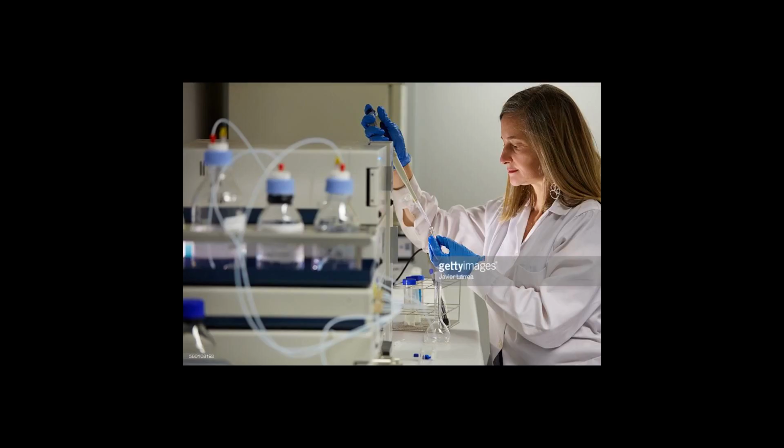This layer changes with any changes in the composition of the mobile phase, e.g., moisture level, causing drifting retention times. Recently, partition chromatography has become popular again with the development of HILIC bonded phases, which demonstrate improved reproducibility, and due to a better understanding of the range of usefulness of the technique.